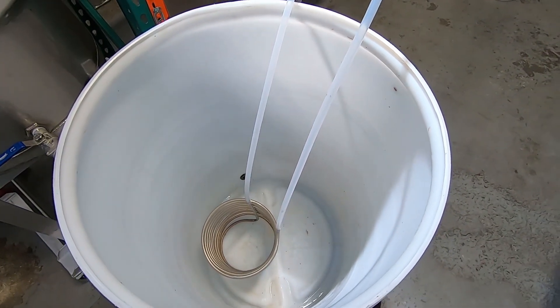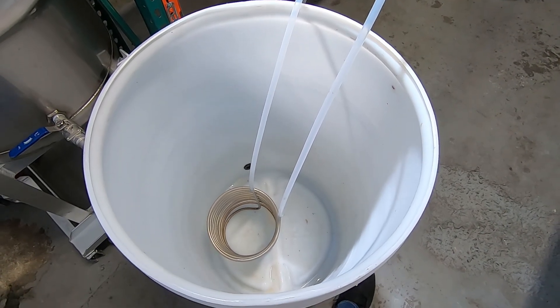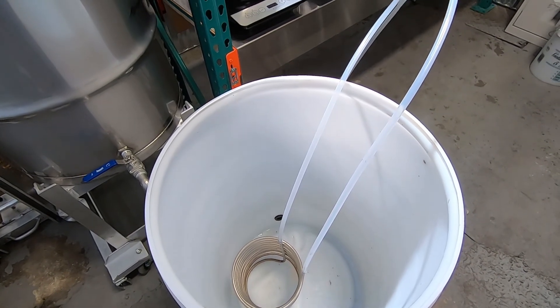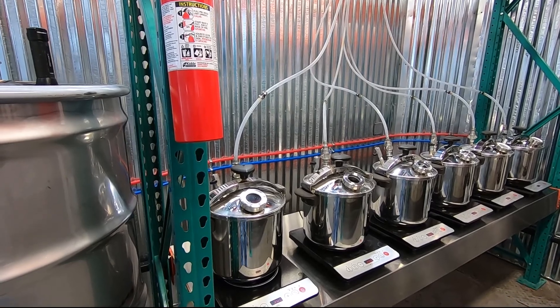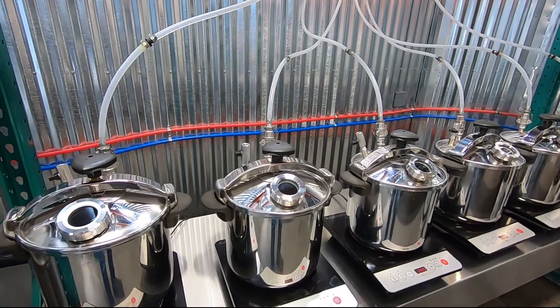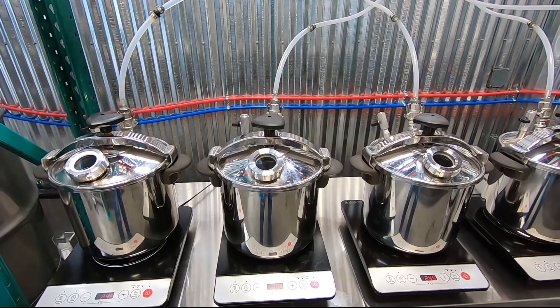I was running four of these guys for a while, and then it really just got to the point where space became an issue, and so that's when I moved to the system that I'm running now, which I'll show you guys here.